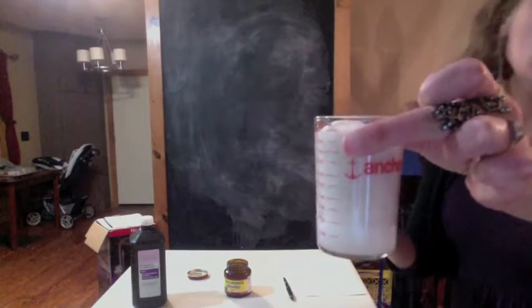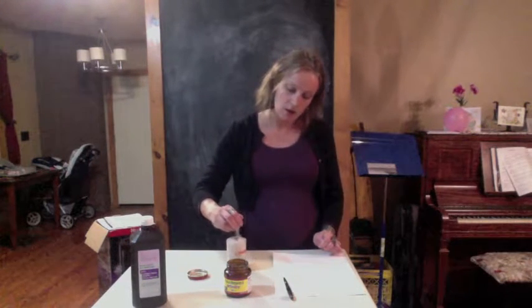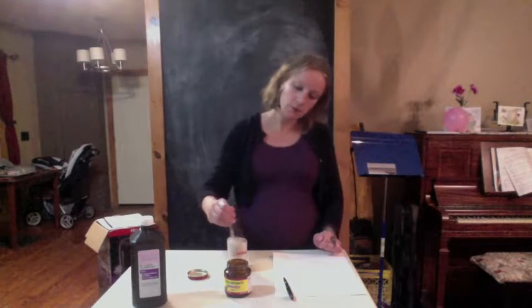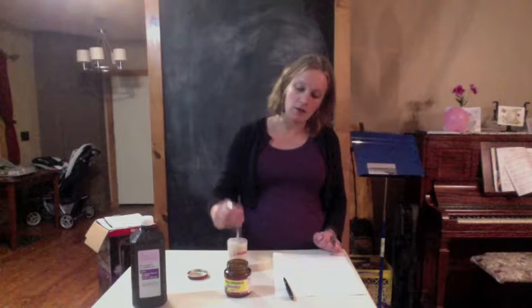All these bubbles are forming, and that is oxygen. Oxygen is being generated. The yeast is catalyzing the breakdown of hydrogen peroxide into water and oxygen. And the yeast remains present and unchanged. That is the function of a catalyst.